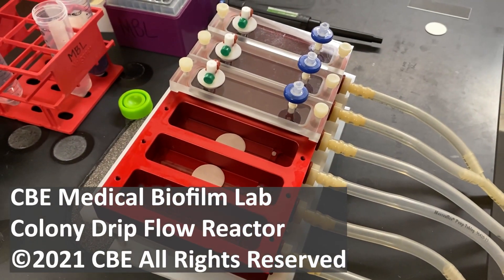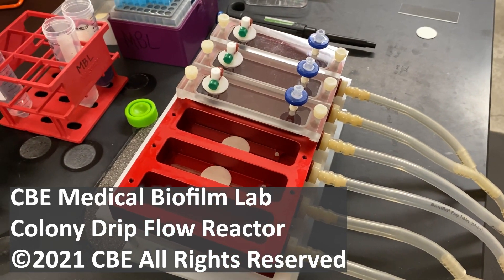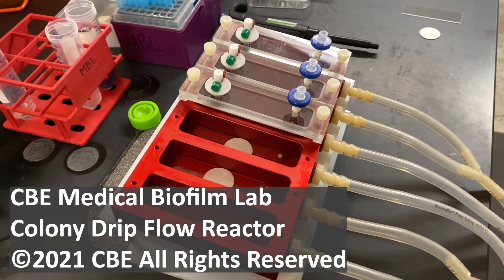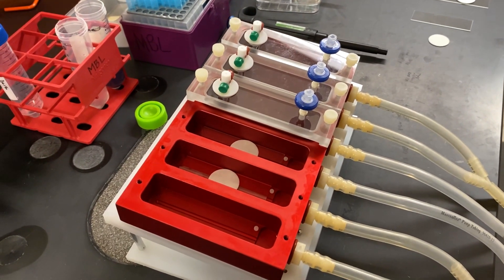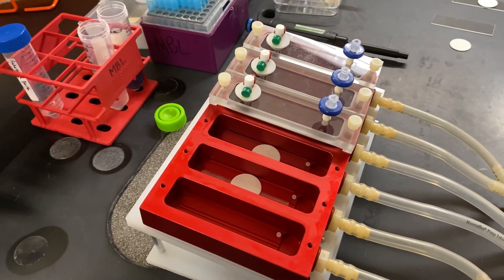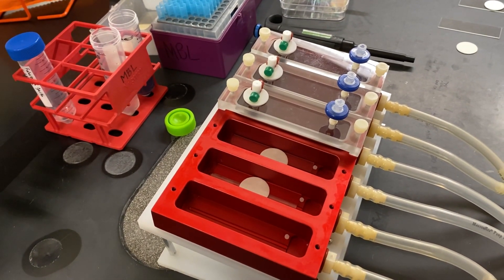Today we are demonstrating how to assemble and sample the colony drip flow reactor model. The colony drip flow reactor is a hybrid model combining the attributes of the colony model and the drip flow reactor. We developed this model to attempt to mimic how a biofilm may grow in a chronic wound.